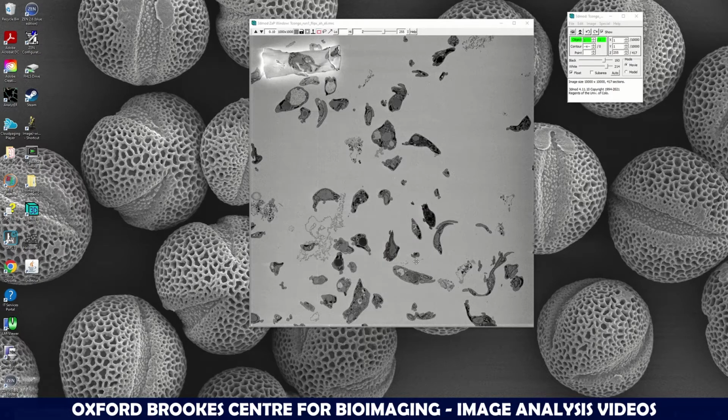Okay, so if you're on right left middle, then with the toggle rubber band on, you click on the image with the right mouse button, and then you'll be able to generate a square, a red square. And you can center this red square with the left mouse button, and then with the right mouse button you can make it smaller or bigger if you want. So you change the shape.